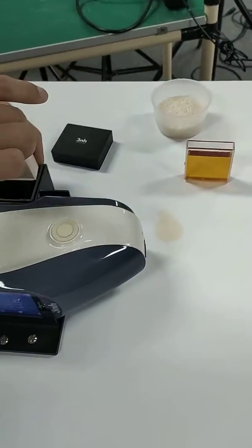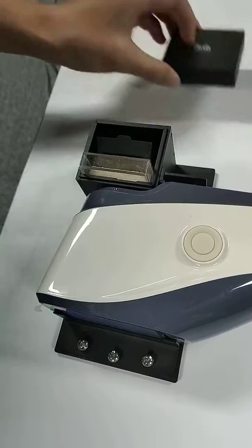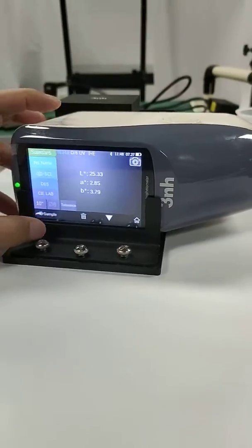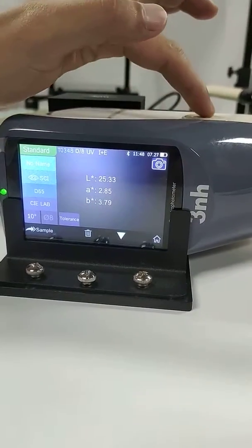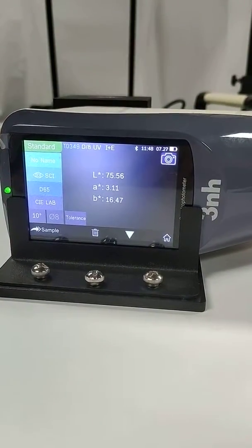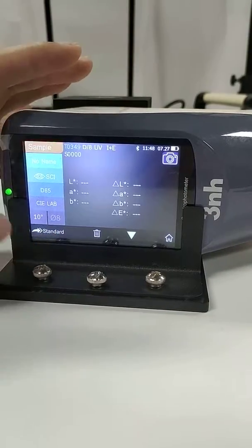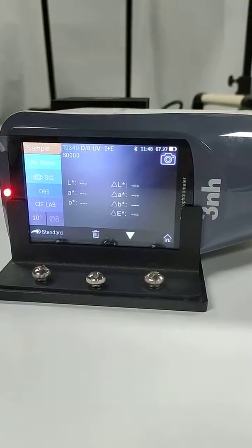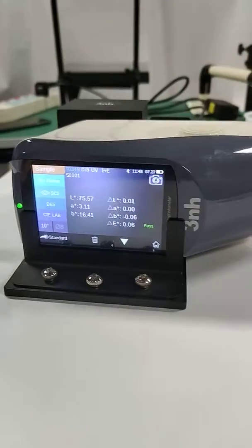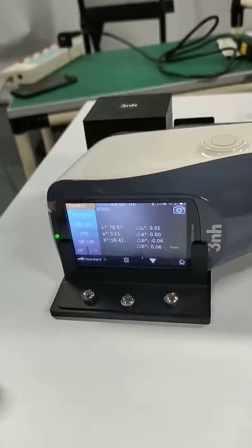The memory is all the same. Cover and press a button. Test result and press a button. This is the memory result. It's all finished.